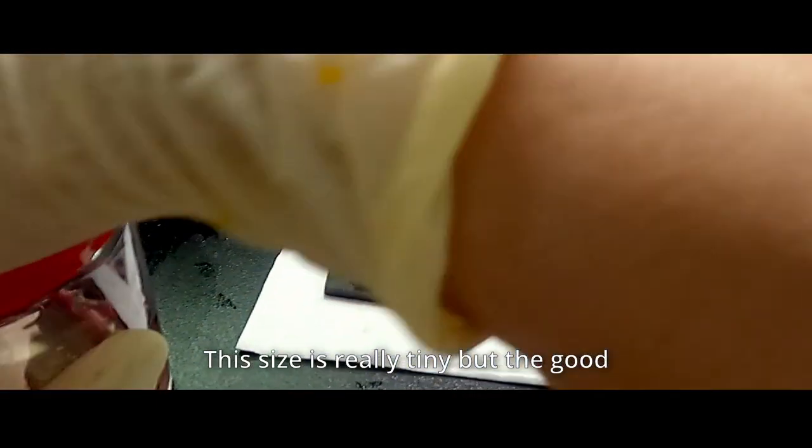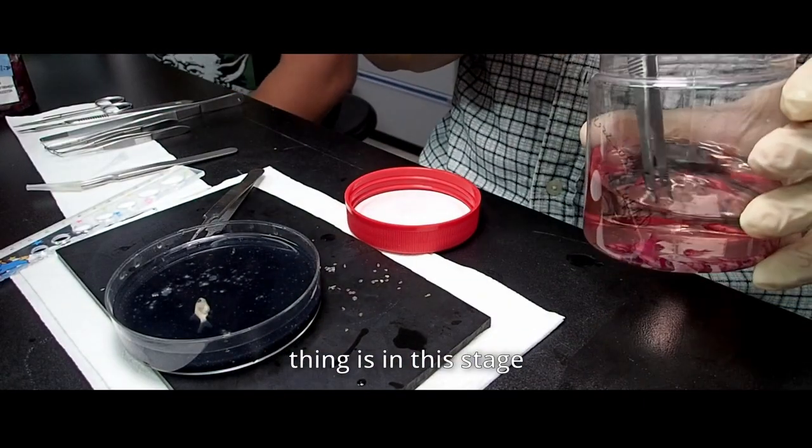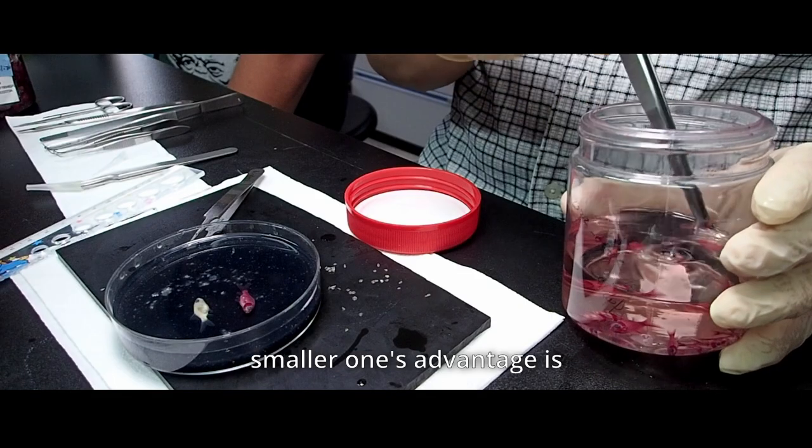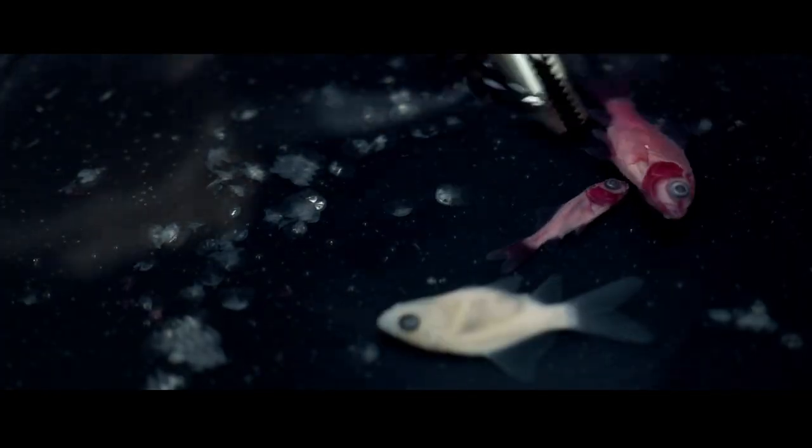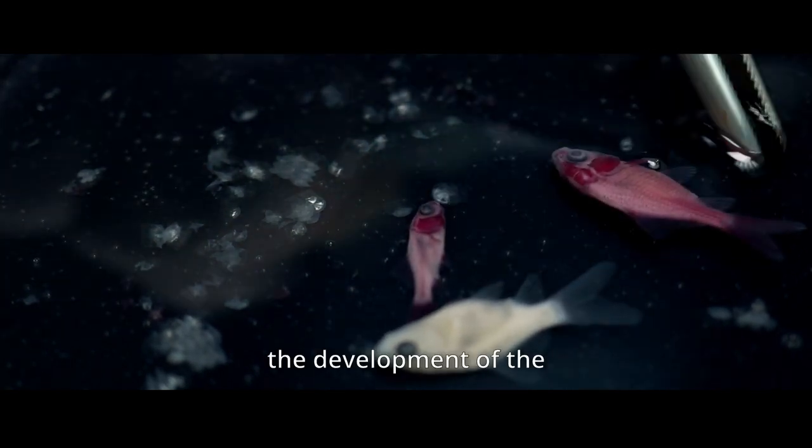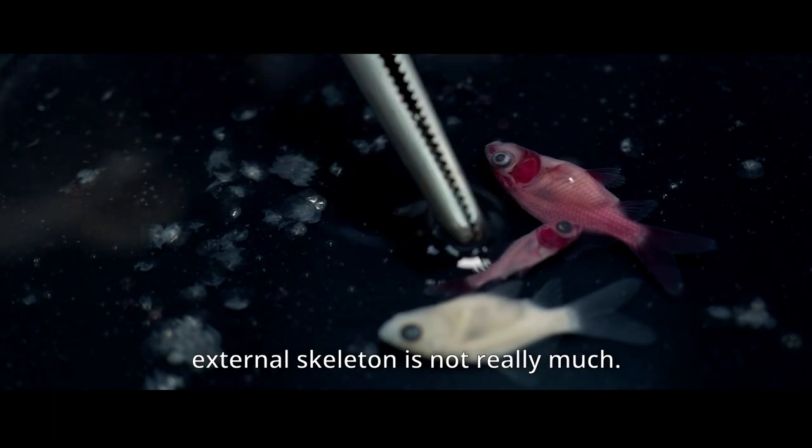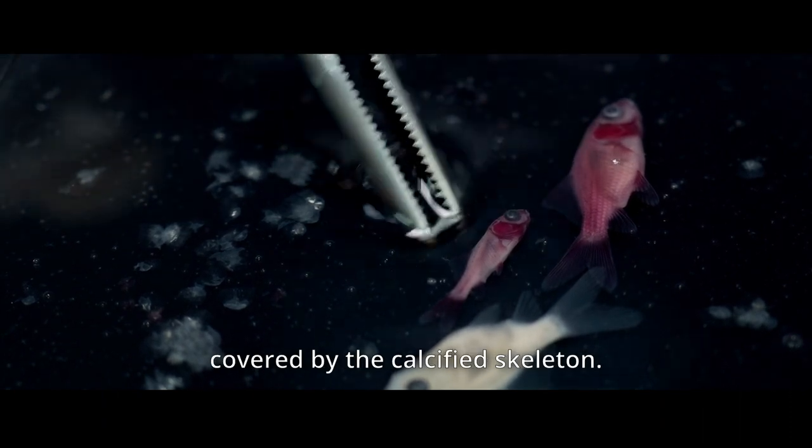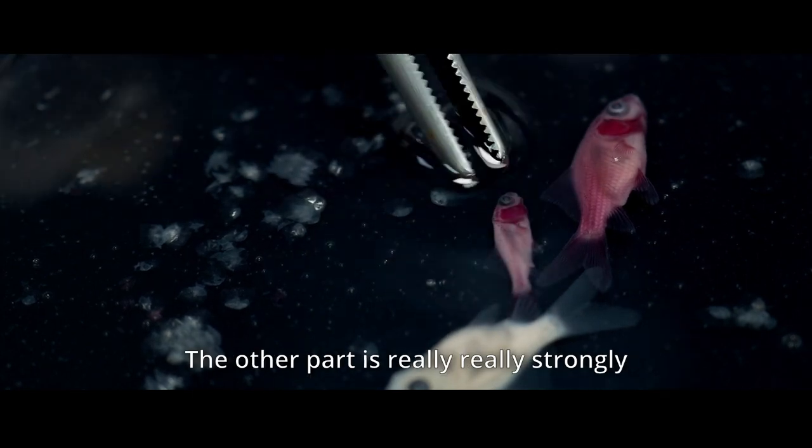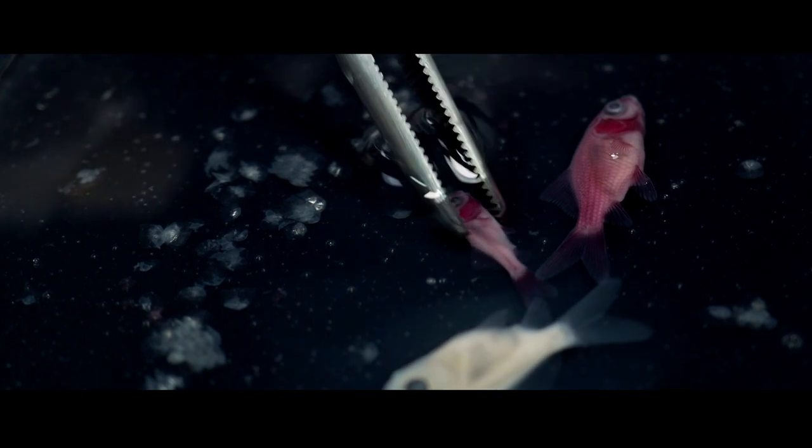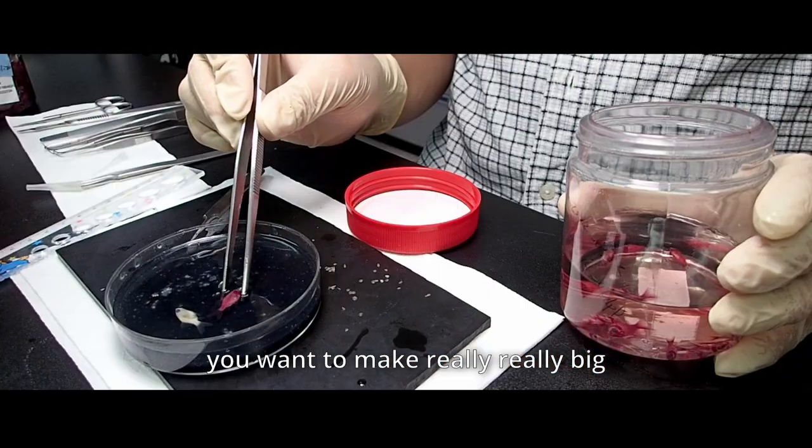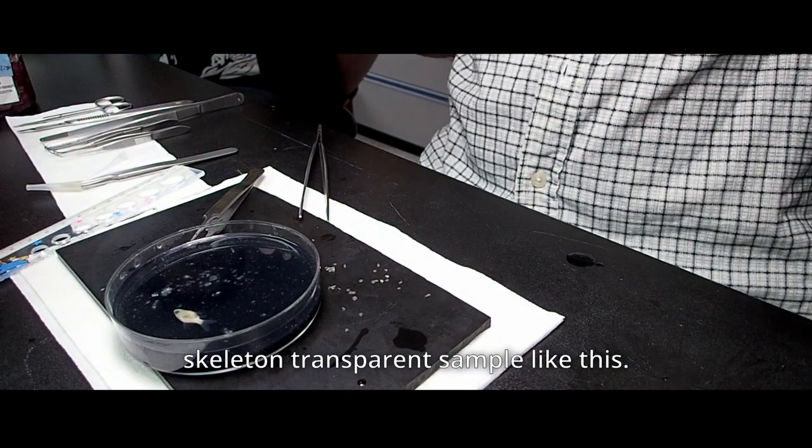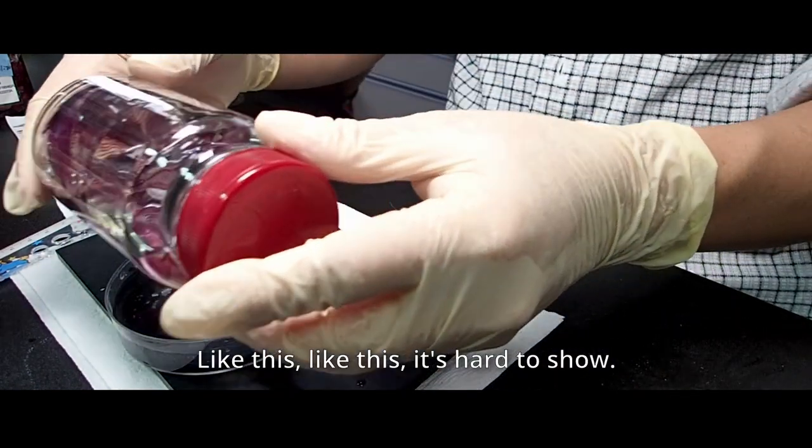This size is really tiny, but the good thing is, in this stage, when you stain the samples with alizarin red, you can see that, like I think much smaller ones, the advantage is the development of the external skeleton is not really much. And this size, this size is obvious. The surface is not really strongly covered by the calcified skeleton. And the other part is really strongly stained with alizarin red. Then, it's depending on the purpose. You want to make really big skeleton transparent sample like this.